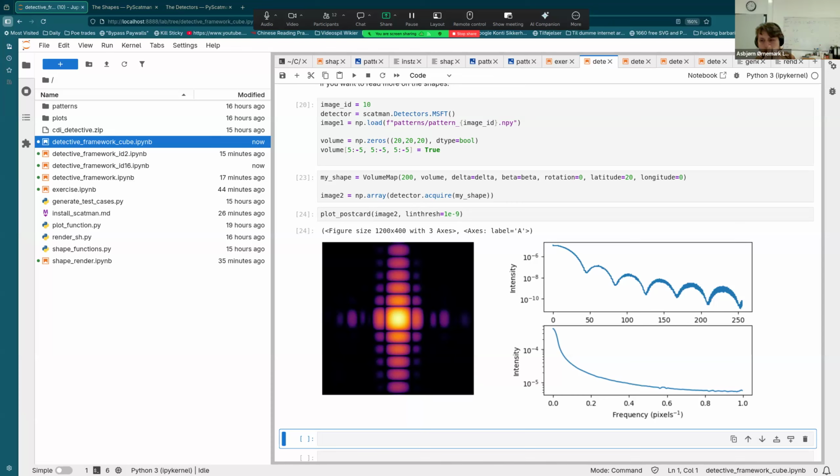I guess that makes sense. If you project the shape down into 2D, then when you rotate it like this, you are kind of elongating the shape a little bit. Yes.